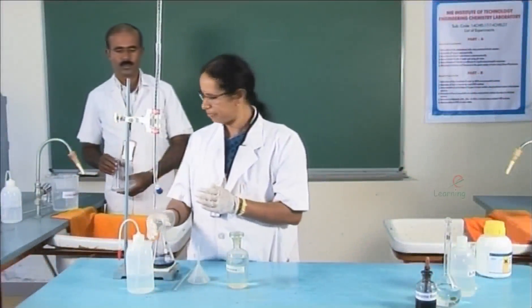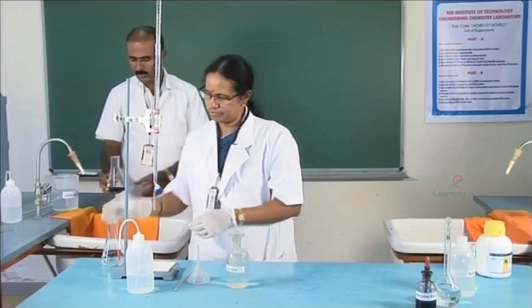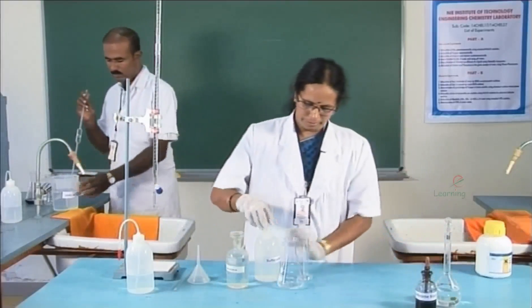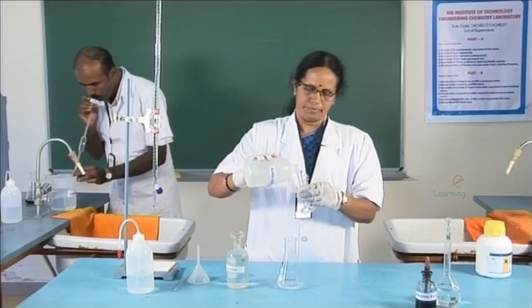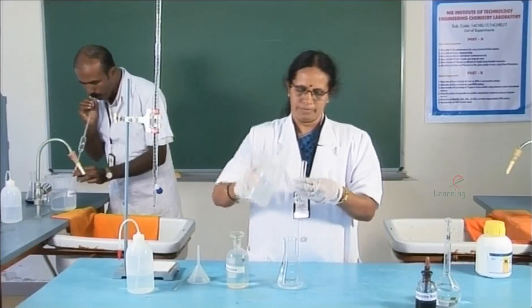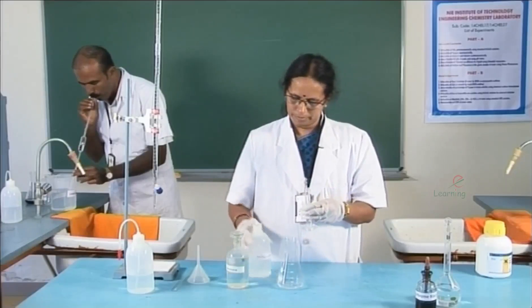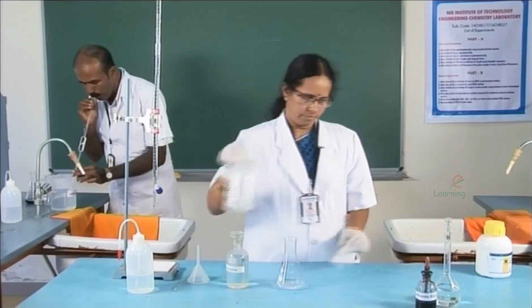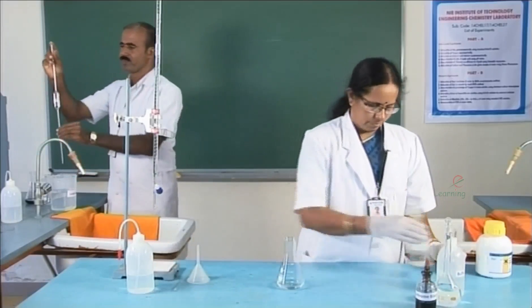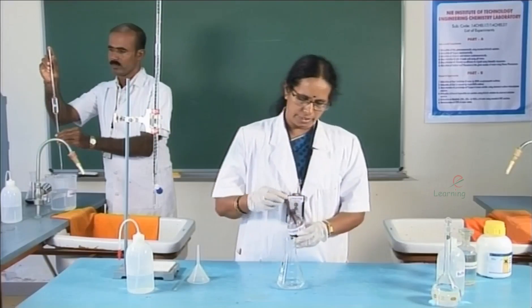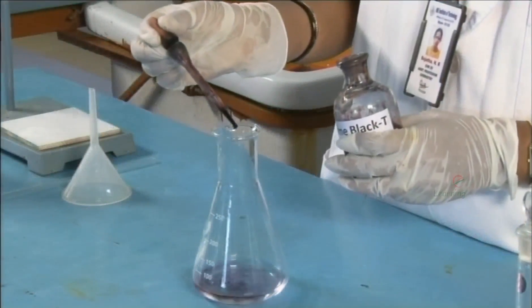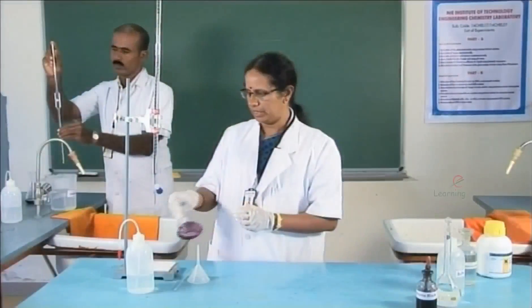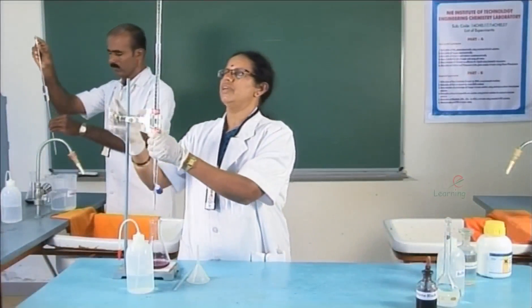For the next trial, the solution has been pipetted out. The buffer is added, followed by 2 to 3 drops of indicator. The wine red solution is titrated again. The initial value is 16, and the titration is continued to get the end point.